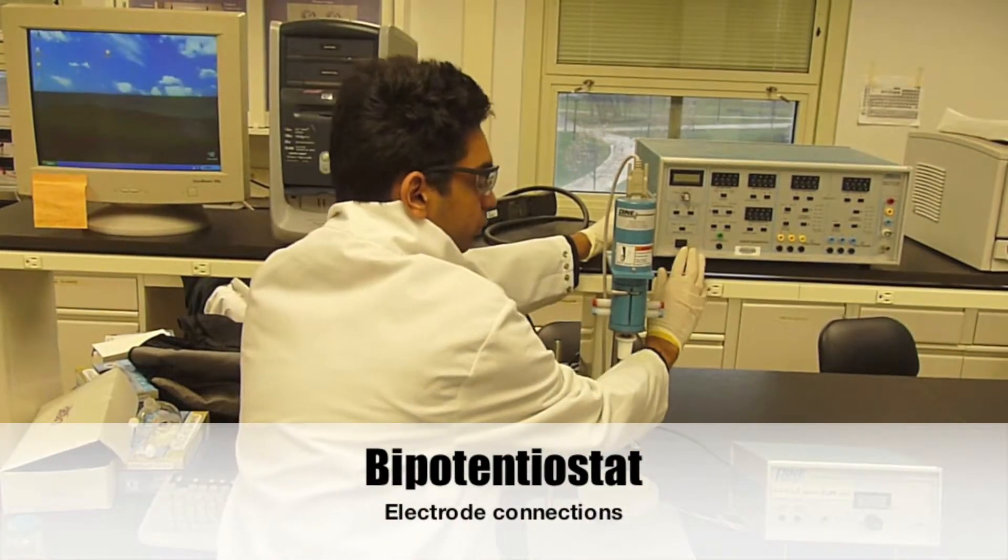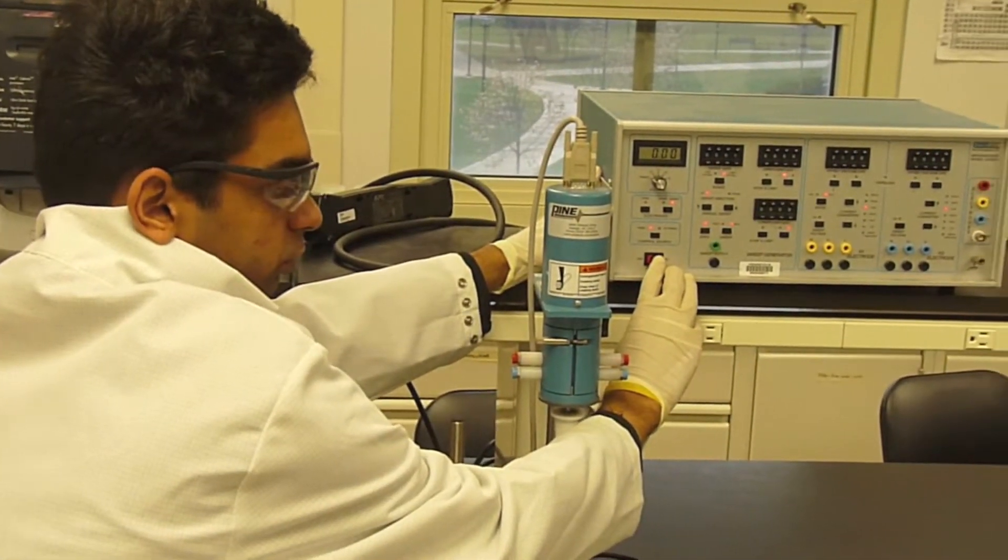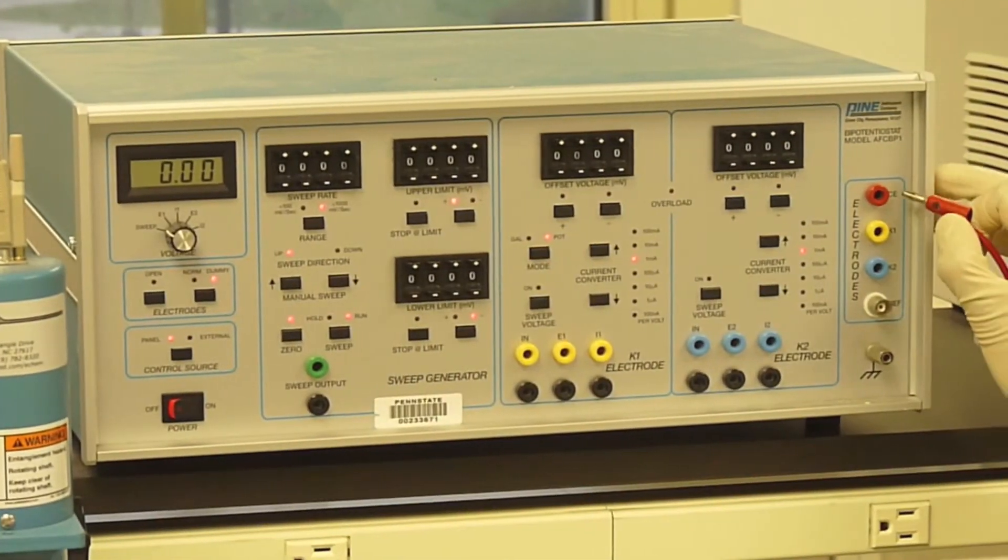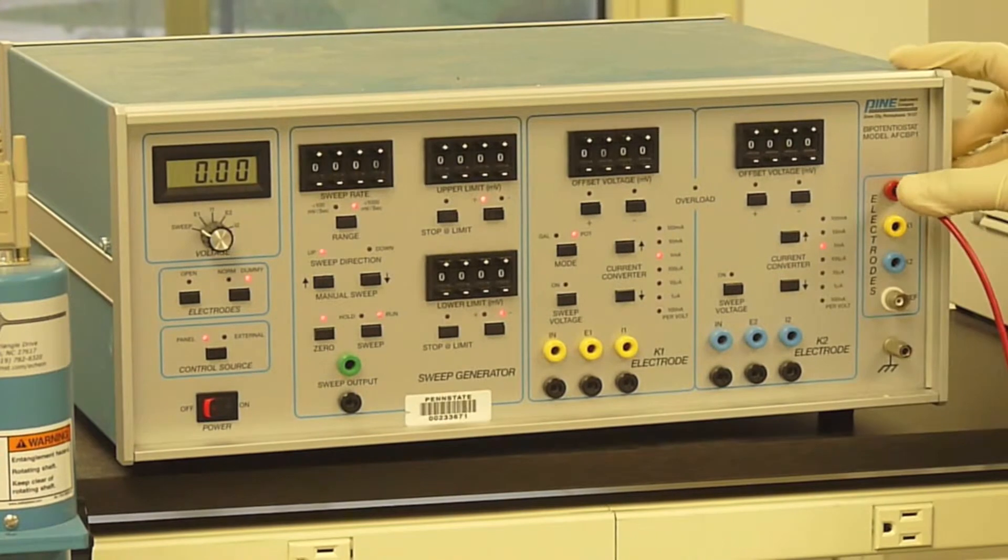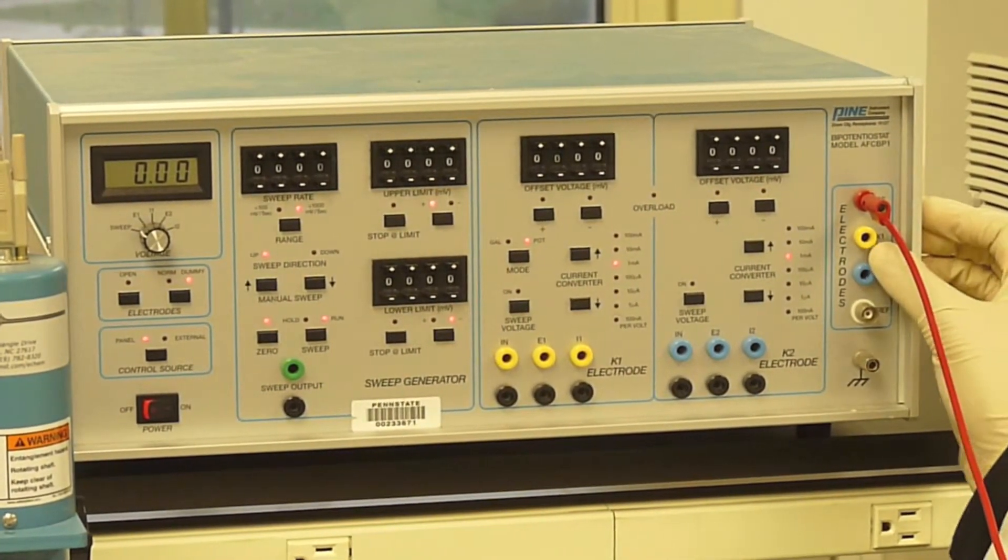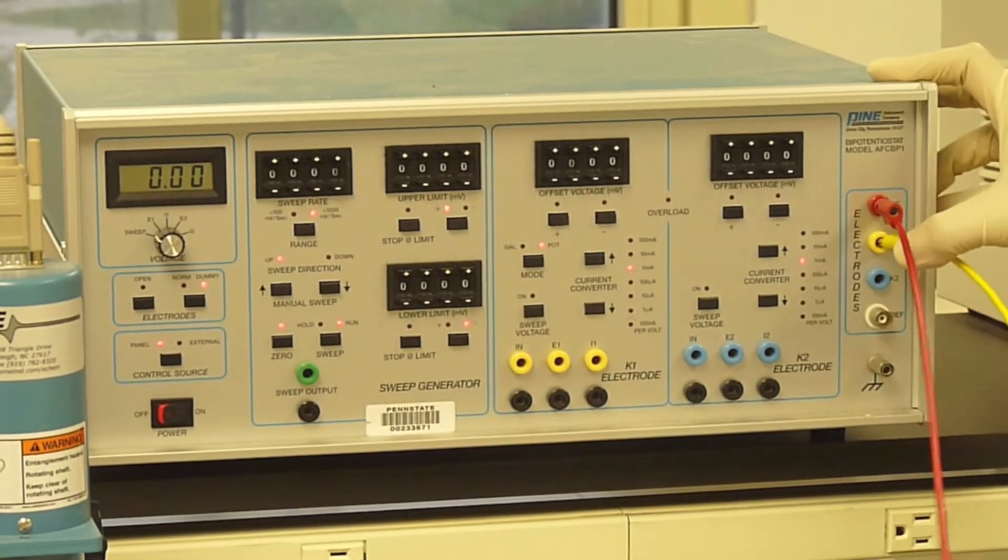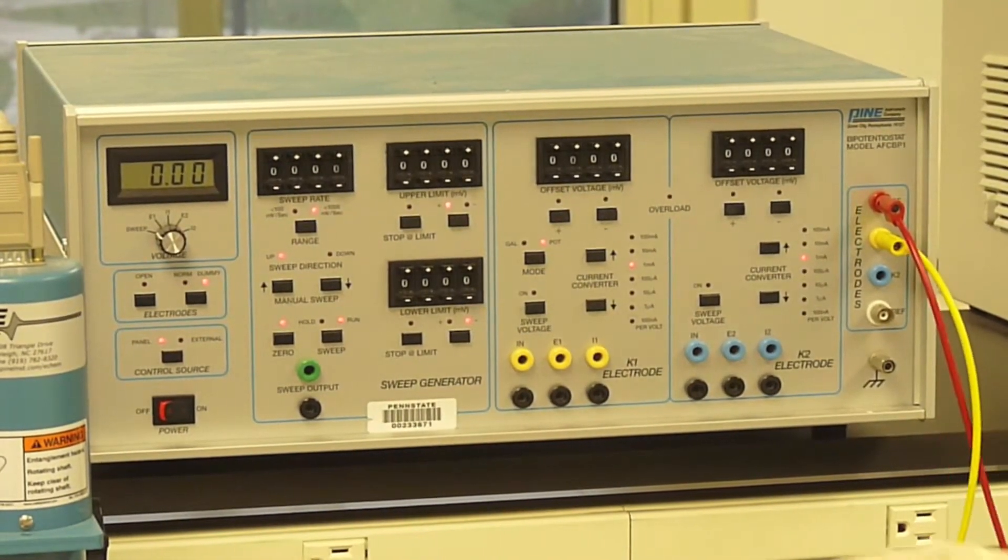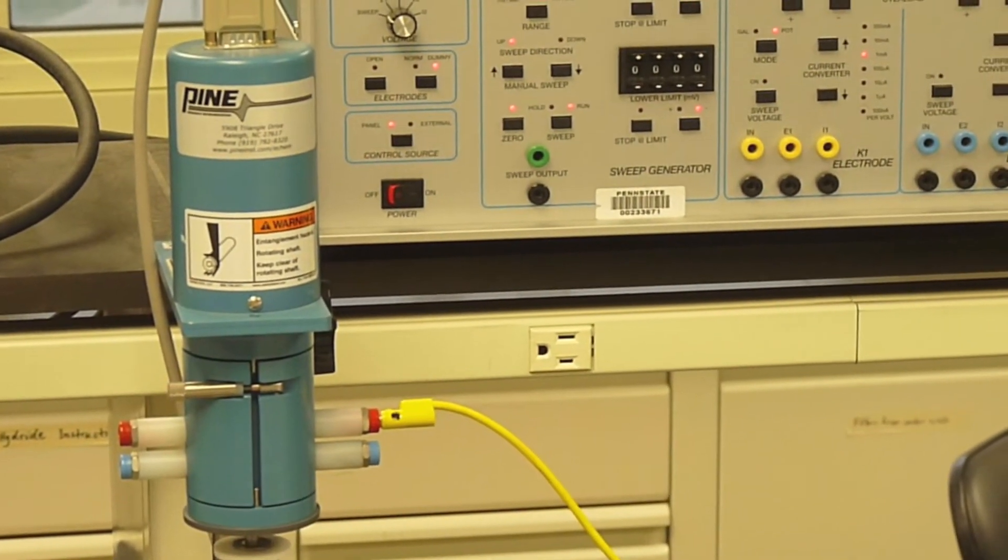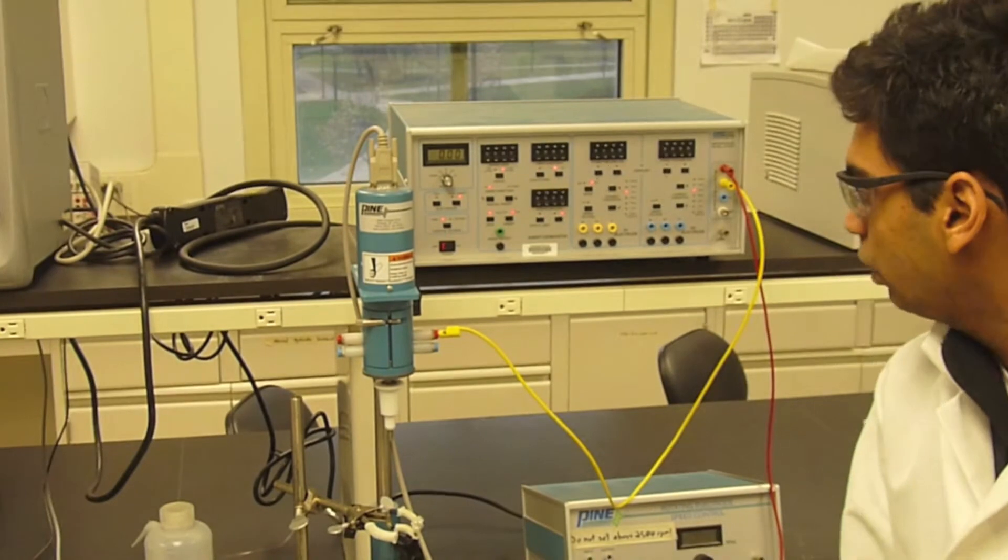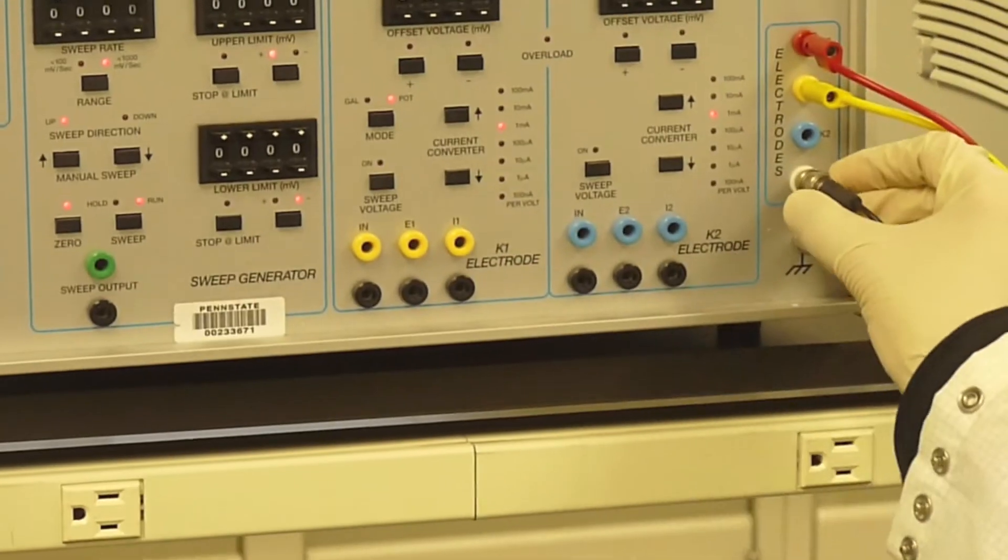To turn on the bipotentiostat, flip the power switch in the lower left corner to the on position. The red counter electrode lead connects to the red CE port. The yellow working electrode lead connects to the yellow K1 port. The other end connects to the red port on the working electrode module. The reference electrode is connected to the bottom socket with a gentle push and turn.